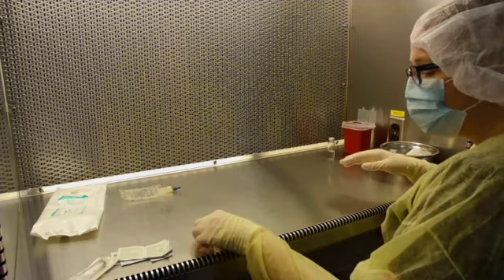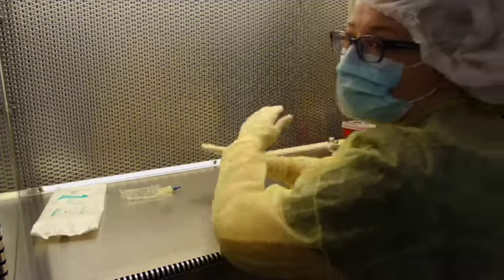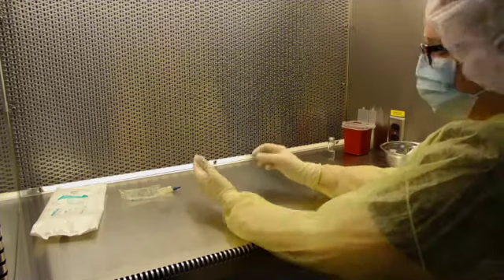Let's talk about organizational flow and where we want to keep our products. I like my products on my right-hand side. You might prefer them on your left, and that is fine. The importance is that we don't cross over when we go to gather a product.